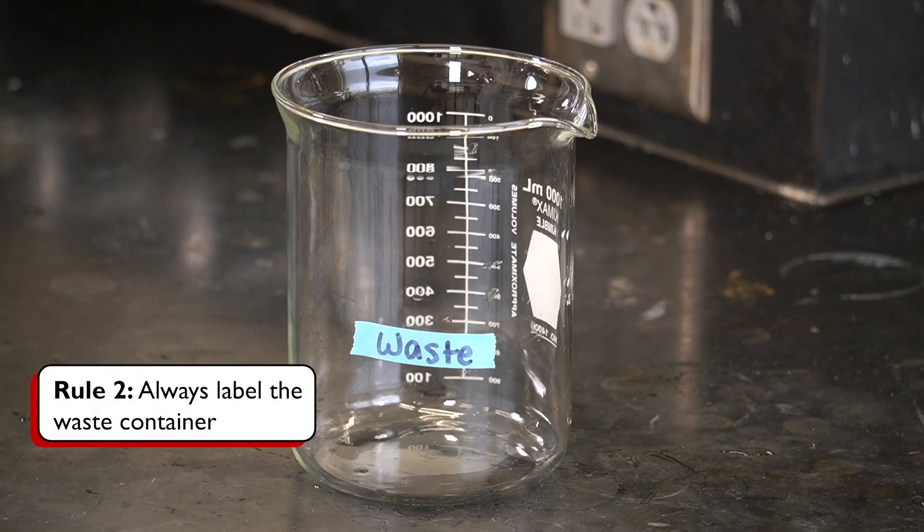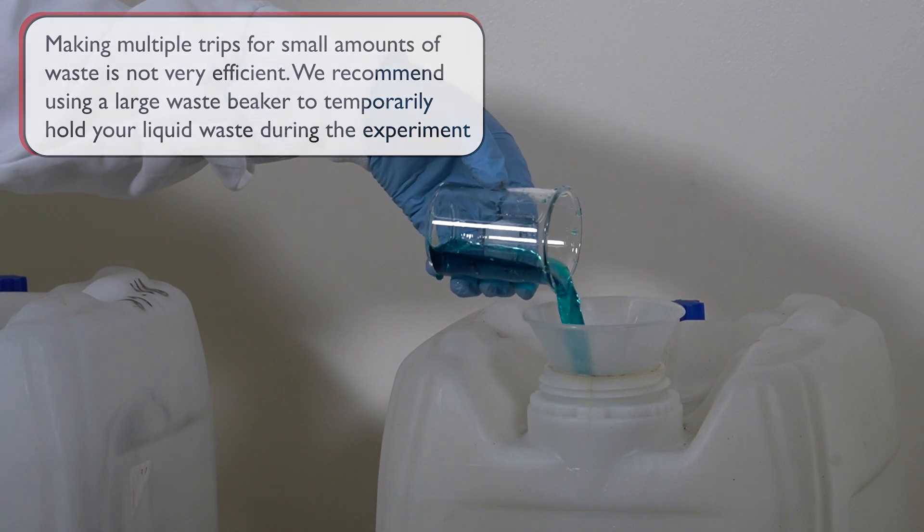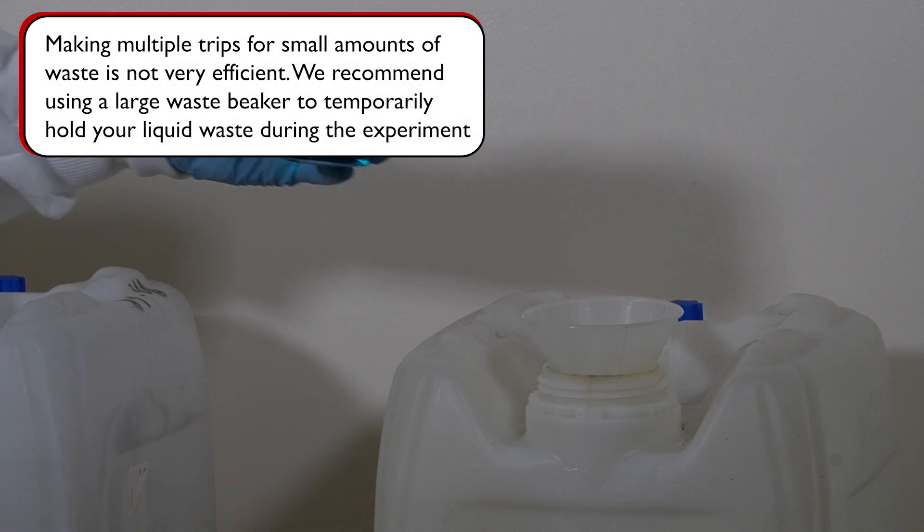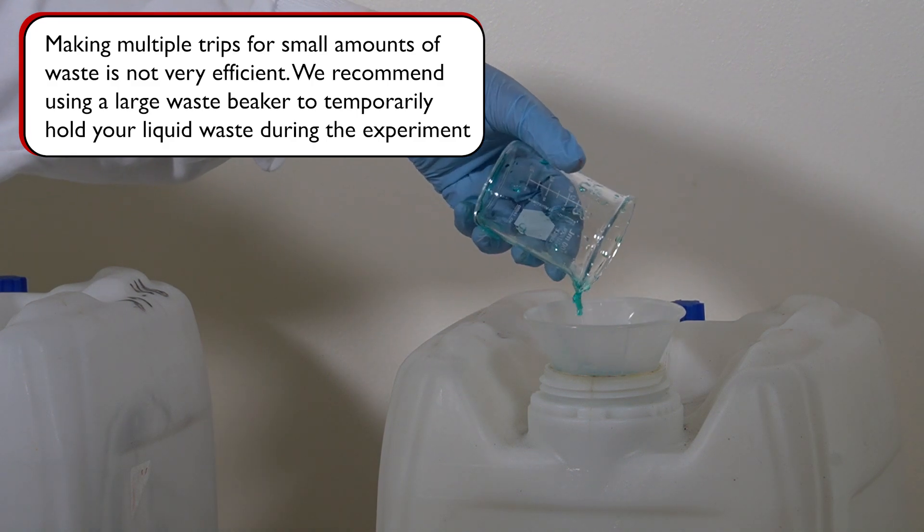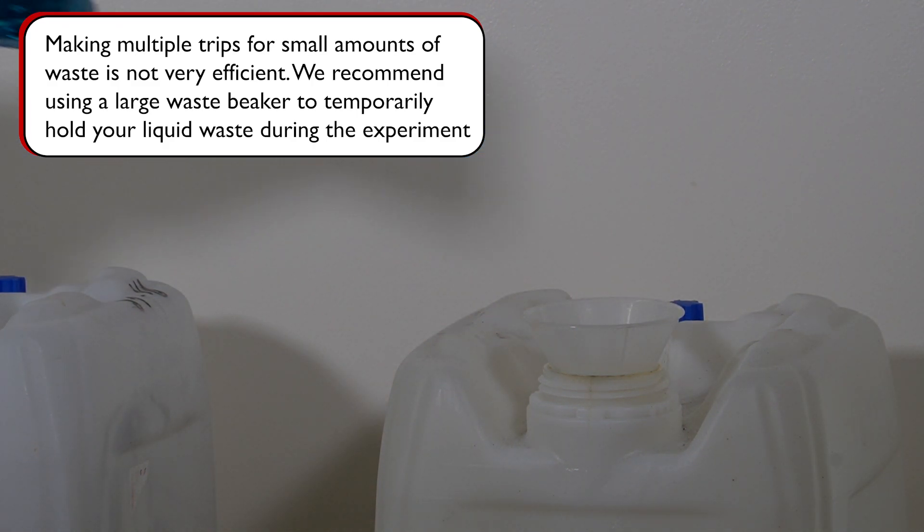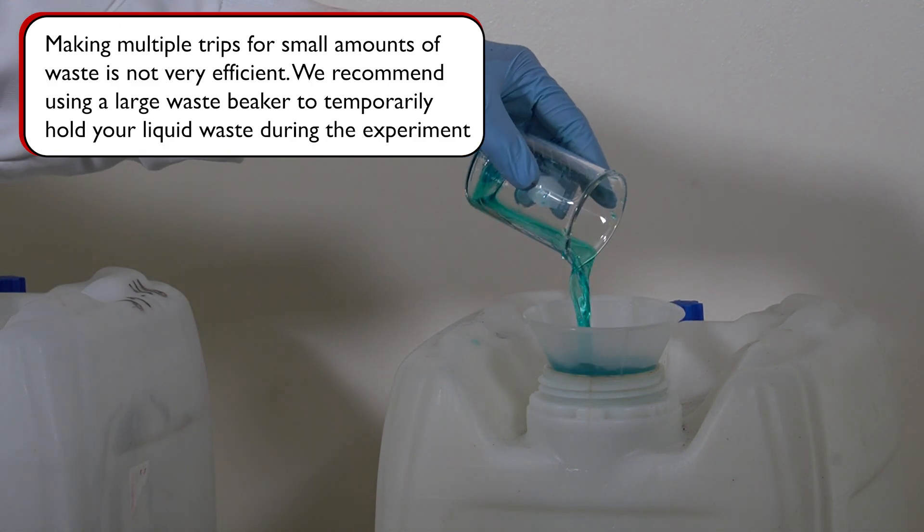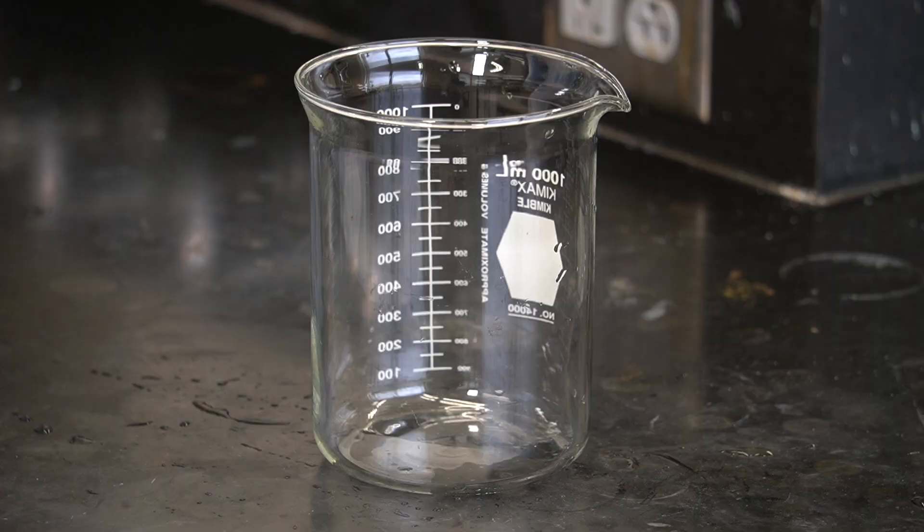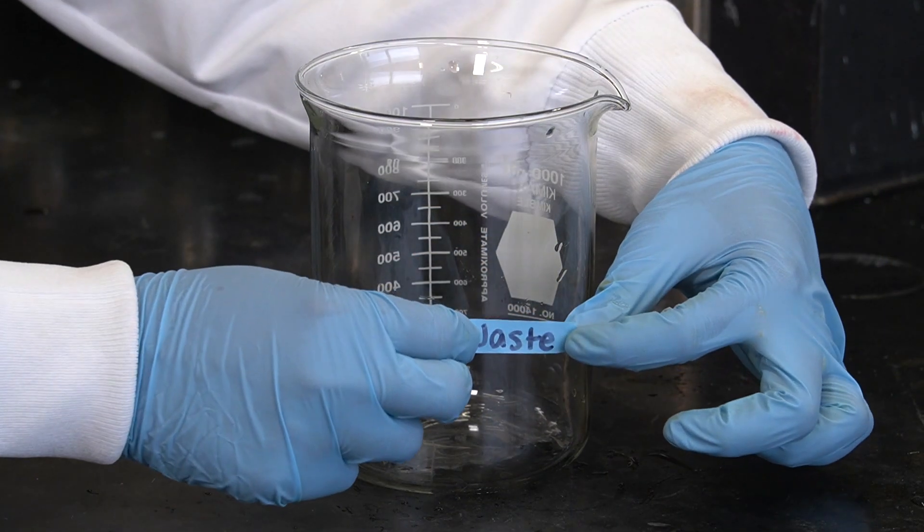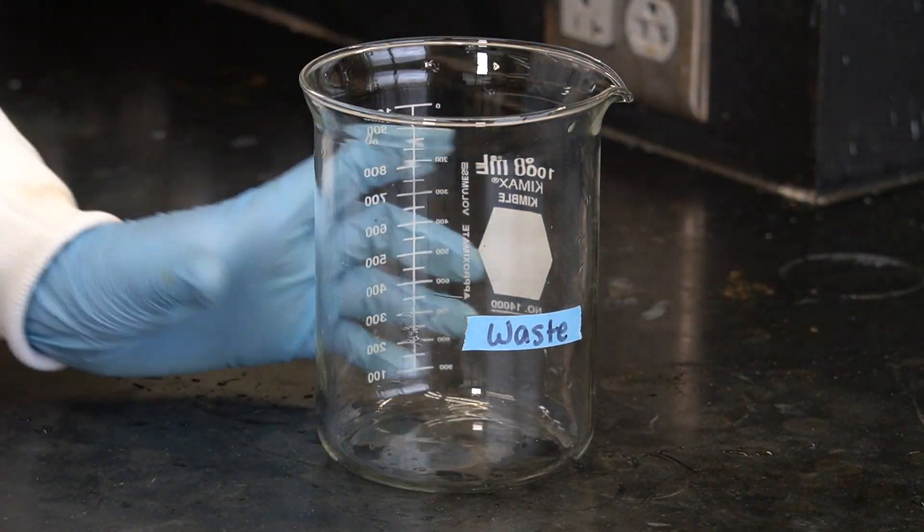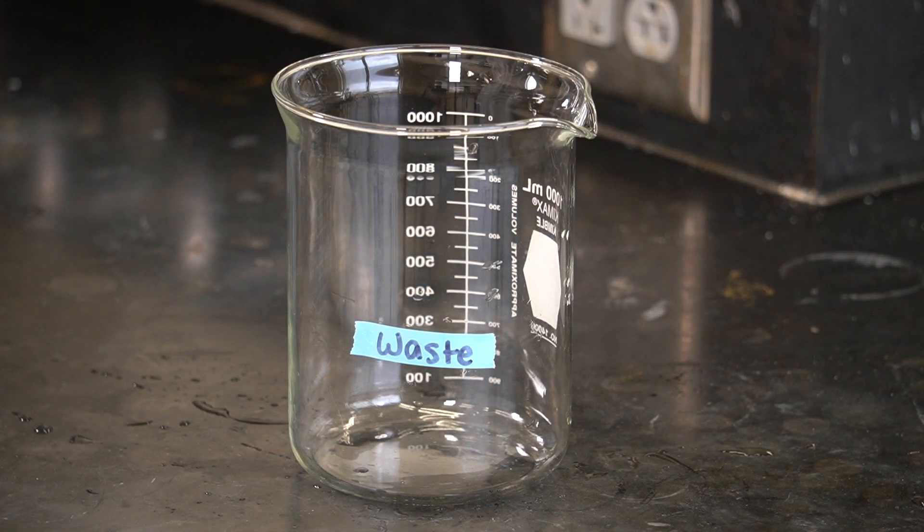Rule number two: always label the waste container. During the experiment, it may be more convenient to use a beaker as a temporary waste container instead of making frequent trips to the waste bin every time a small amount of waste is generated. To do so, we can choose a large glass beaker and label it as the waste beaker. If it is used for general aqueous waste, a waste label is sufficient.